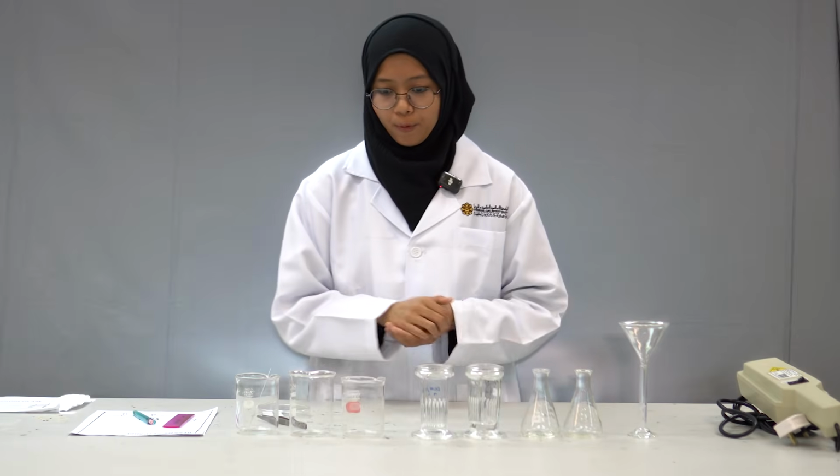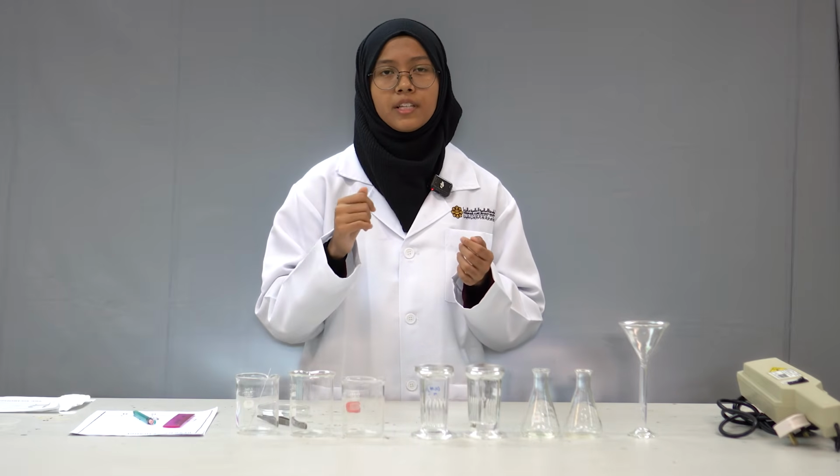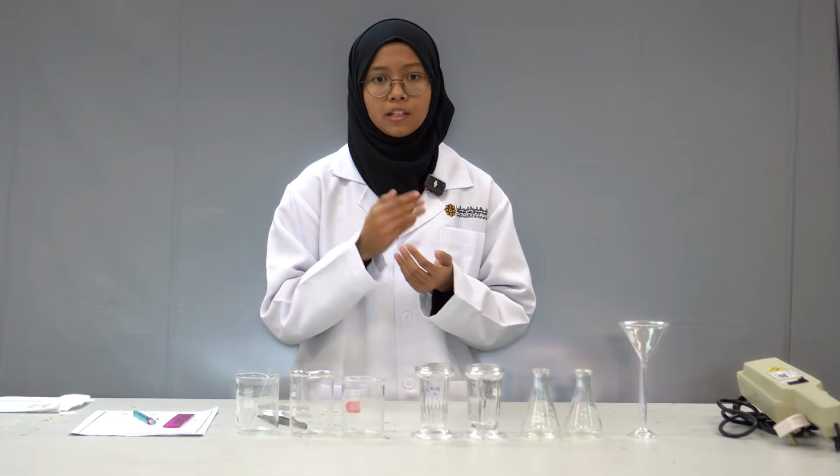In industry and laboratories, there is some difficulty in separating components that have similar chemical properties, like maybe the same polarity. So thin layer chromatography is the easiest and most inexpensive way for us to separate and identify the components, and to tell whether a sample is pure or impure. So that is for the introduction and problem statement.